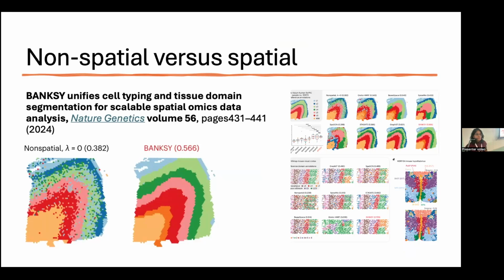I've done something that is just on phase contrast images with no single cell matrix at all, and I've seen spatial patterns, right? So if it's there, you will see it, all right?